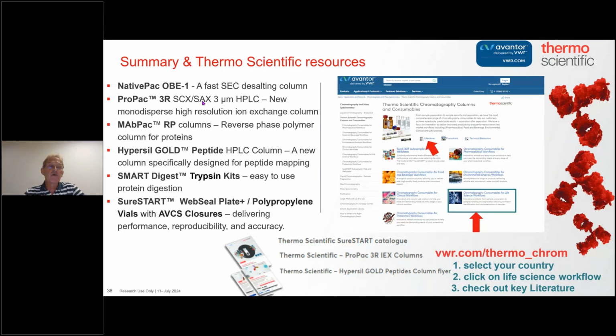If you go to high and low pHs with a weak exchanger, you can lose the charge. The difference between a weak and a strong is that you can run them in extremes of pH and the charge will still remain on the column.